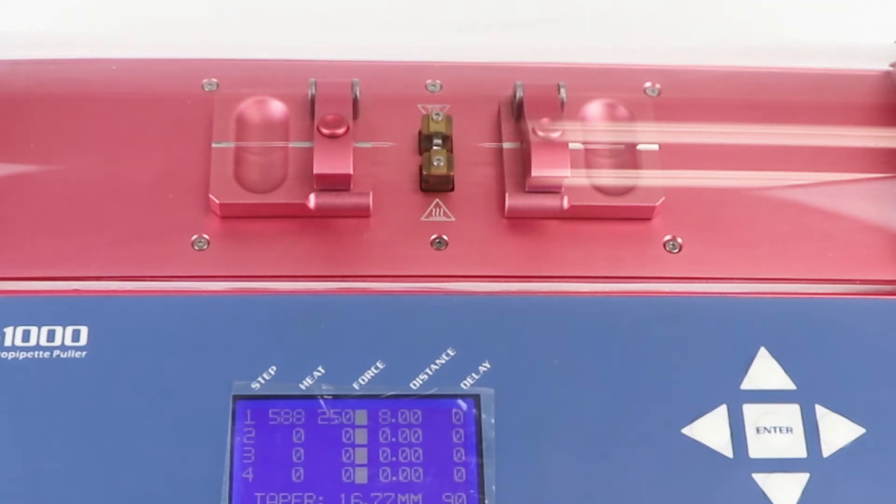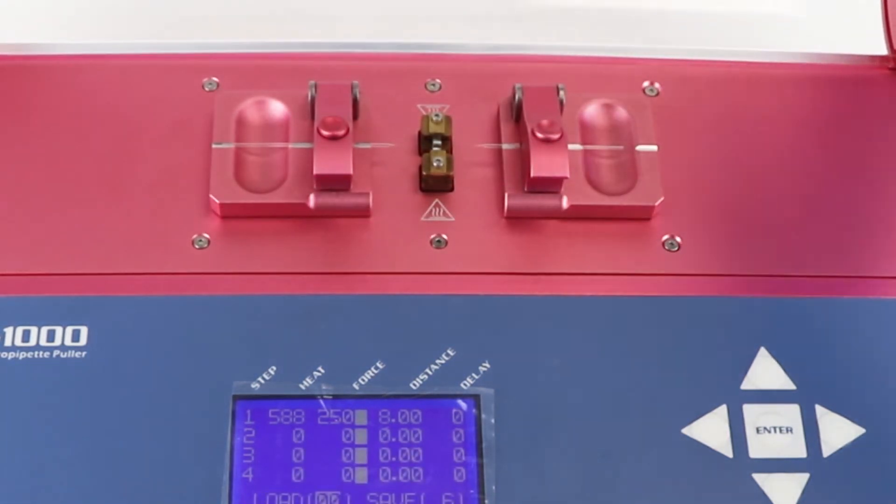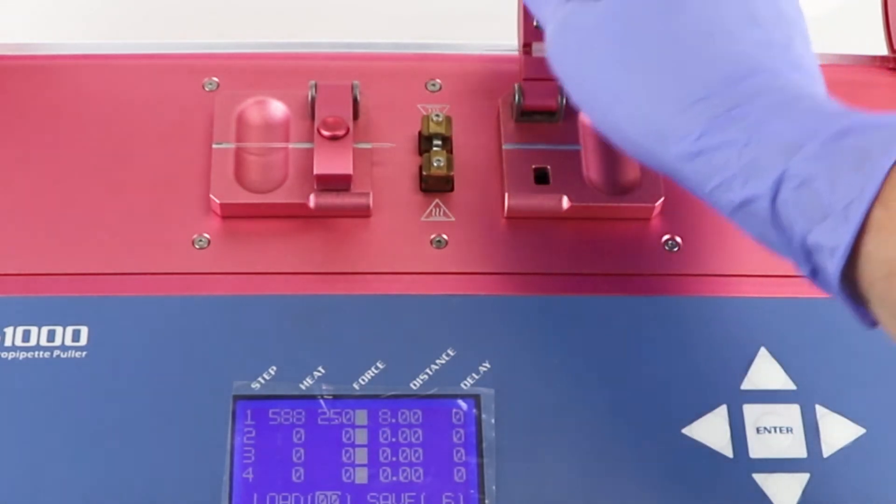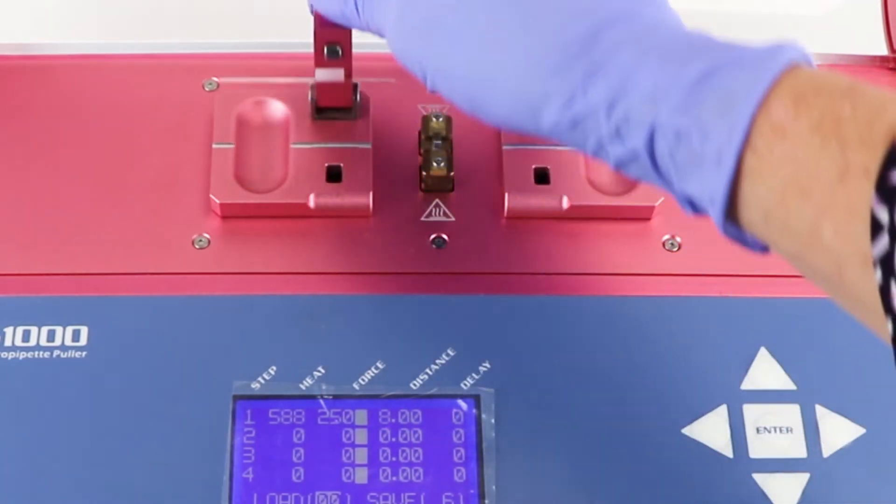The Pull 1000 is capable of producing a vast array of pipette shapes such as a long graduated taper, a short graduated taper, and even a short taper B-stinger.